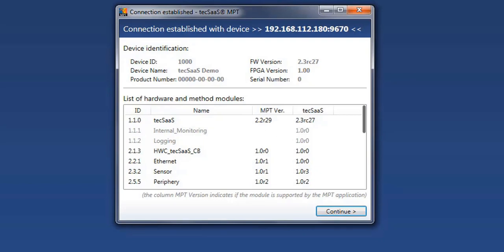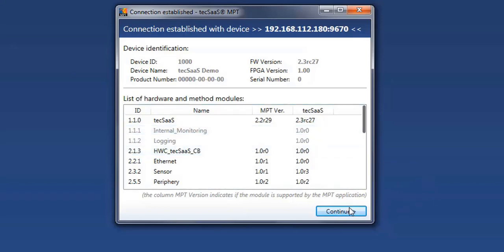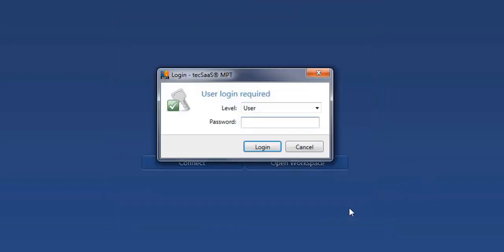At this stage, some identification information is shown and the click on continue leads you to the user login window, where you can, for example, login as a regular user.